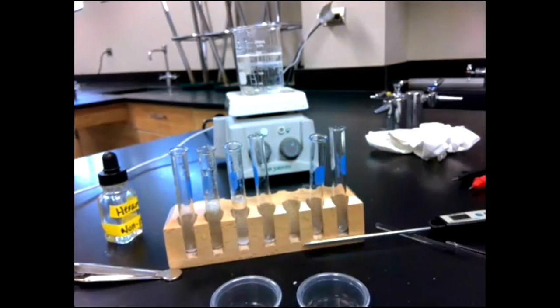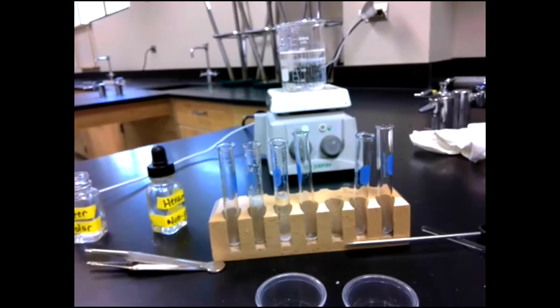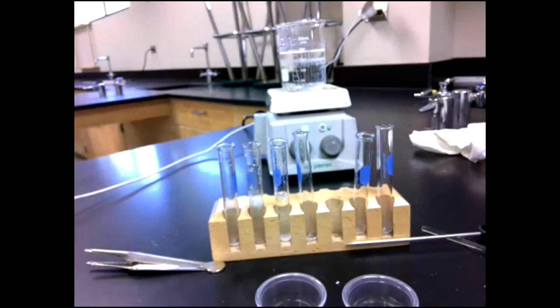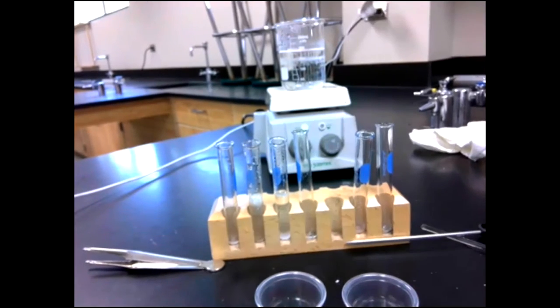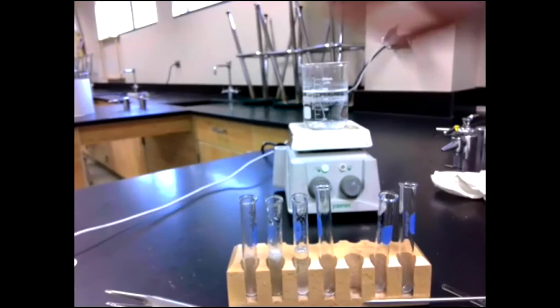A conducts, but not as well as a metal, just to keep it in perspective compared to what we did last time. Where was my lid? Lost it. Okay, so the water is supposed to be boiling. Like I said, I turned it down because it was annoying me, it kept rattling around. Let's see.